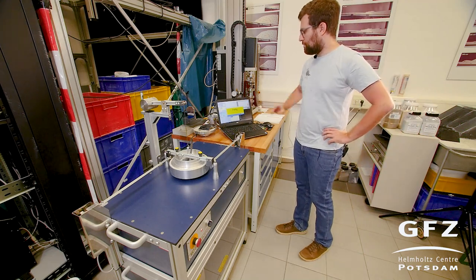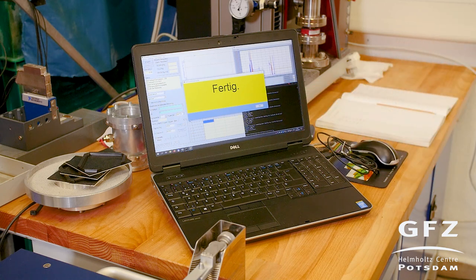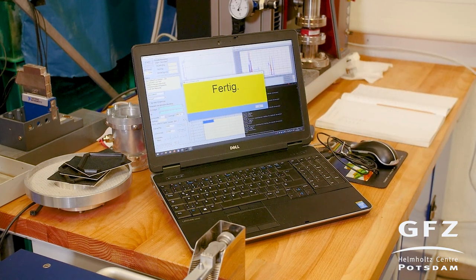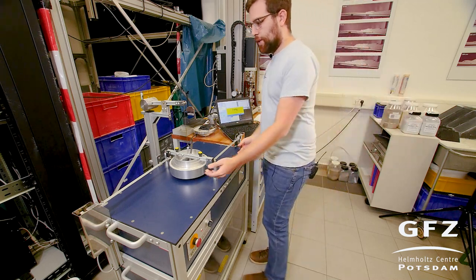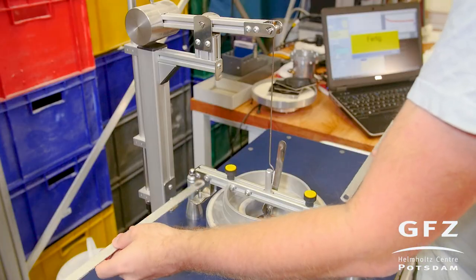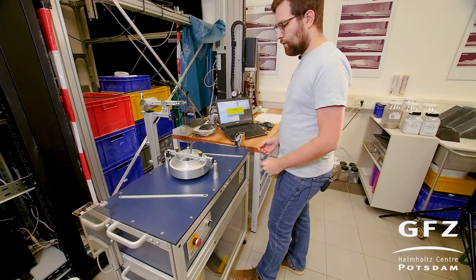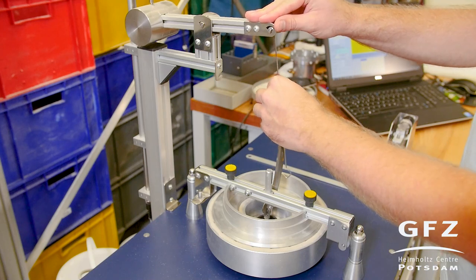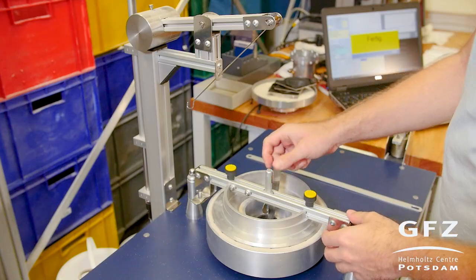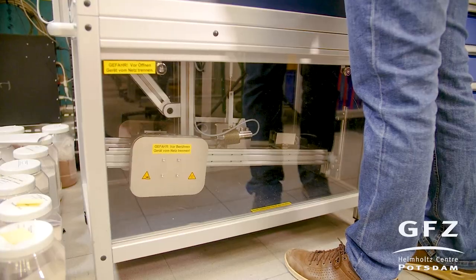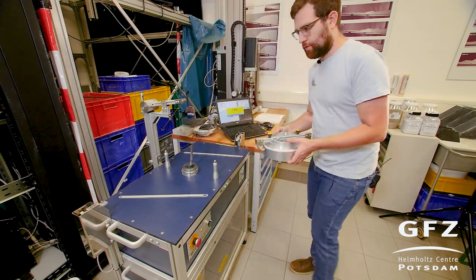Now you see the measurement is done and ready, which is indicated by this yellow window. There is also acoustic feedback from the laptop, but I turned it off because it's very annoying. Now we can remove the tie rods, which are completely free of stress with no tension anymore. Then we remove the lid displacement measurement device, remove the handle from the crossbar — the handle is connected to the normal load displacement machine — and then we remove the shear cell.